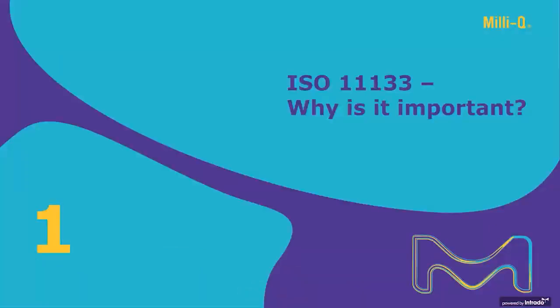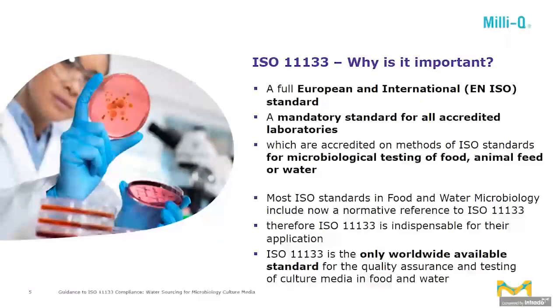All right, so now I will give the hand to my colleague Barbara. Barbara, can you tell us a little bit about the ISO 11133 standard, please? Yeah, thank you very much. First of all, welcome also from my side, and thanks for the nice introduction, Estelle. So to give you an overview and background information of ISO 11133, why it is important.